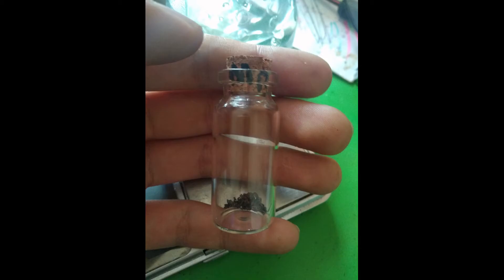0.03 grams of manganese. Honestly, from 1.34 grams of manganese dioxide, this isn't all that bad — like a 3% recovery or something.